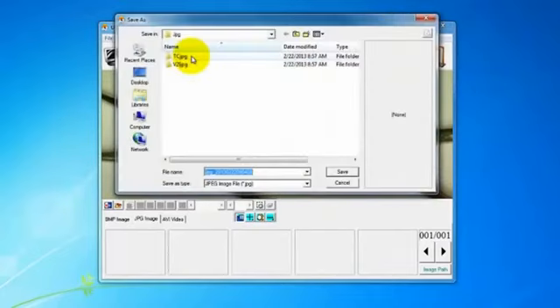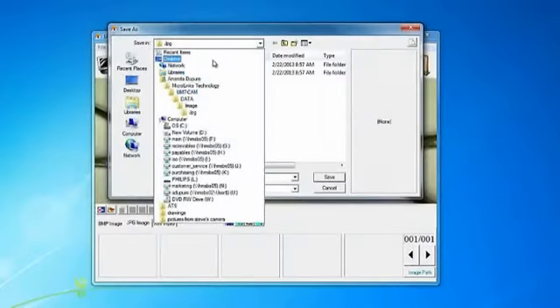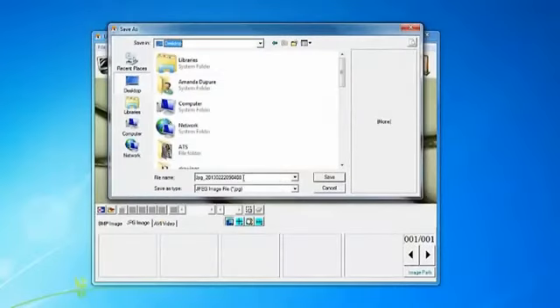This is the Save Image icon. Select this option when saving and storing in the image's preview window. When pressed, a screen will pop up. Click on the folder you want the image saved in and rename the file. The image will be saved as a JPEG.